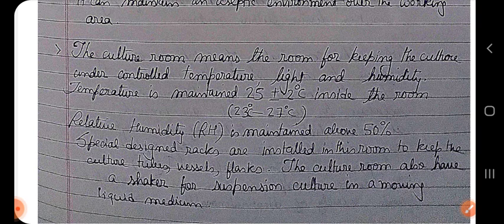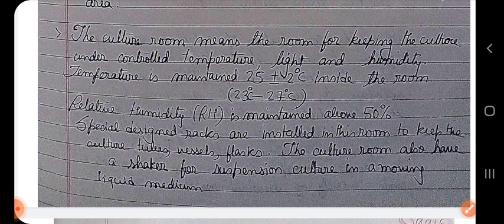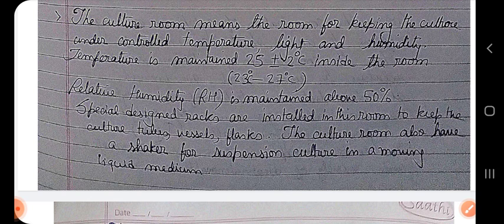Although when we go for greenhouse, that is just after this, when the plants have grown enough, all the roots and shoots have grown maturely in the plant tissue culture in the lab, and we transfer them into greenhouse condition, within the greenhouse the humidity is maintained at about 40%, but here initially it is maintained at 50%. Specially designed racks are also installed in this room to keep the culture tubes, vessels, and flasks in proper position. Normally, we tilt the tubes and flasks in a particular position so that all the explants are exposed to the light. And the culture room also has a rotary shaker for suspension culture.